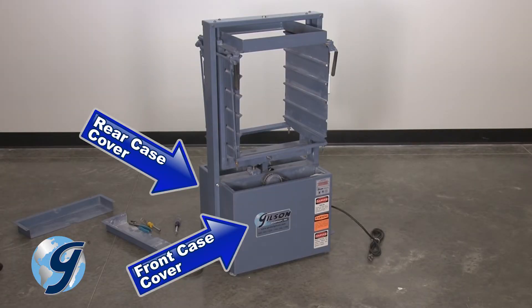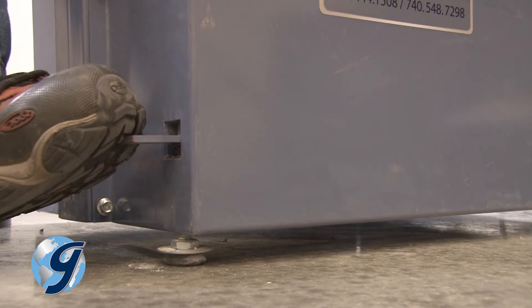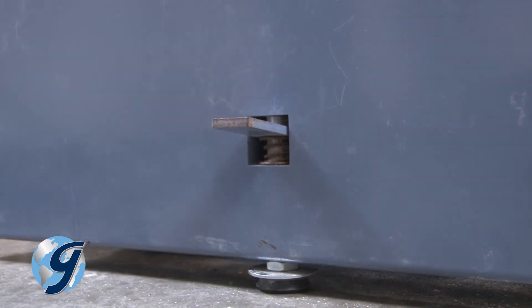To remove the front and rear covers, first lower the unit close to the floor by depressing the foot leveling tabs. This will bring the unit's feet close to level with the mainframe.